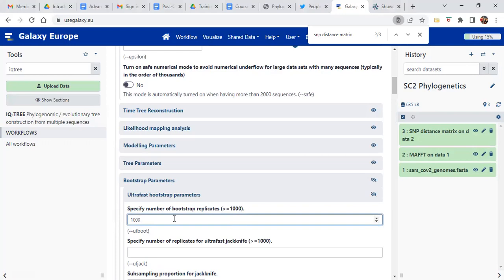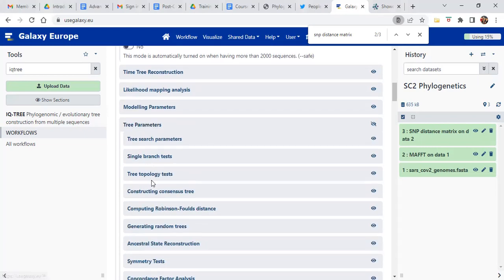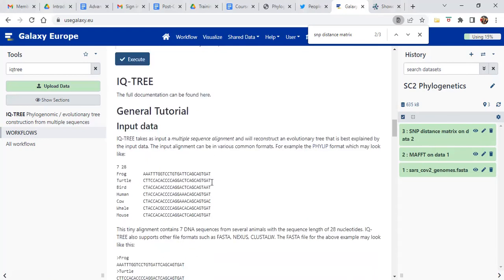It will calculate out of 1000 times that it generated the tree how many times it produces exactly the same branch at the same place — the same taxa in the same position — and give you a percentage or ratio. Once that is done, you have to do this part first, then go to Tree Parameters. Scroll down to 'Constructing a Consensus Tree' and click on 'Compute consensus tree of trees passed'. Then scroll to the bottom and click Execute.